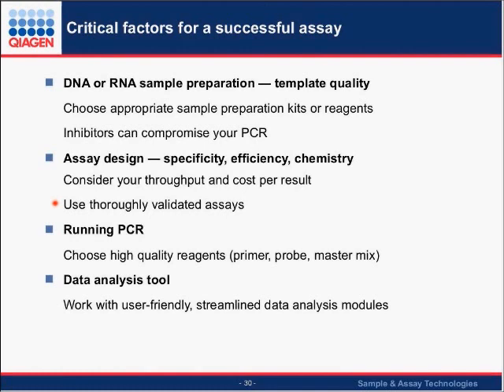These are validations that are done by external labs to make sure that the assay works well. If you have an assay that is not going to receive that kind of validation, because there are only certain ones that do, you will have to validate the assay in your lab yourself, and that becomes very important. So there are validation things that you might want to do.